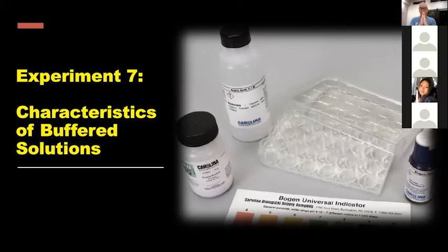And at that point, we get a big change in pH because we go from having no free sodium hydroxide to now having free sodium hydroxide, and the concentration of sodium hydroxide will increase the pH substantially.